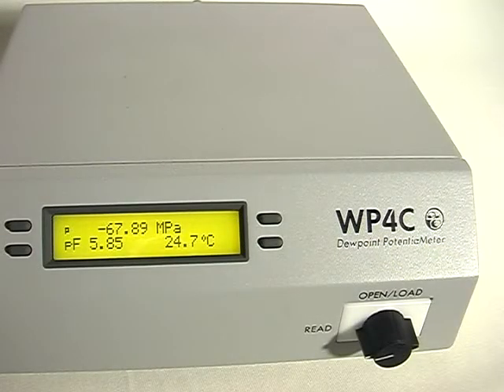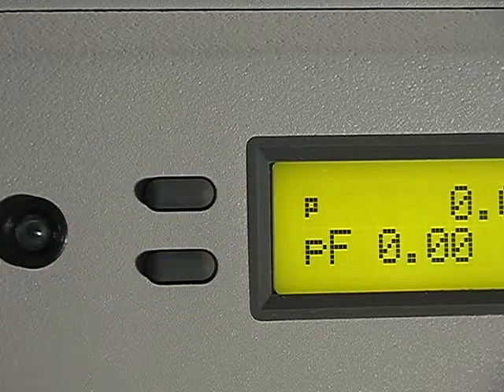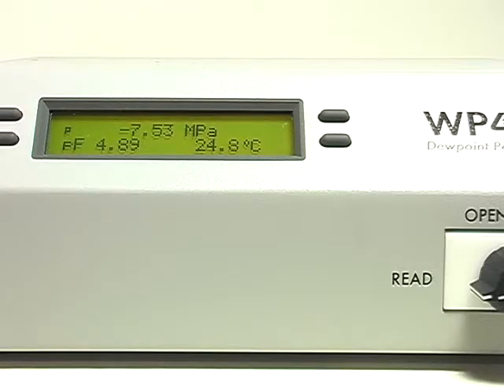The reading cycle will immediately begin. The screen shows preliminary measurements as the sample and vapor in the sealed chamber come to equilibrium. Another new feature of the WP4C is precise mode. Water potential measurements can be inaccurate if they're made too soon. Precise mode checks to make sure the sample has fully come to equilibrium before displaying a final reading.